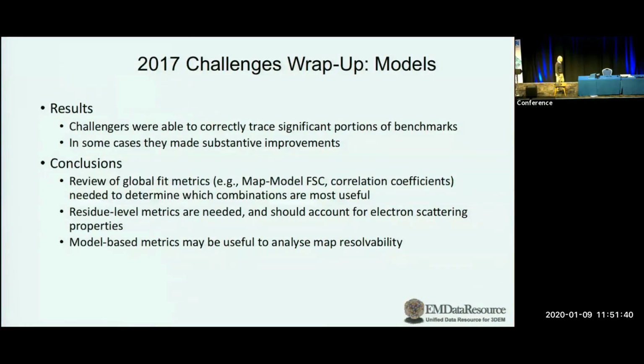Since then, we decided there are 7 or 8 different benchmark datasets for the community to do, and it took a long time. So last year we did only a few, and we also decided to look at some really high resolution data, because it turned out that at lower resolution, it is harder to judge exactly what criteria to use, because we want to use the best practice that many of you have developed over many decades.